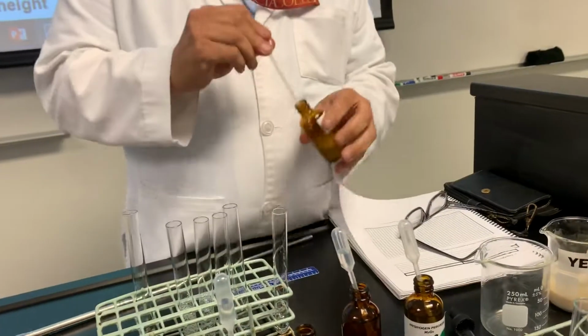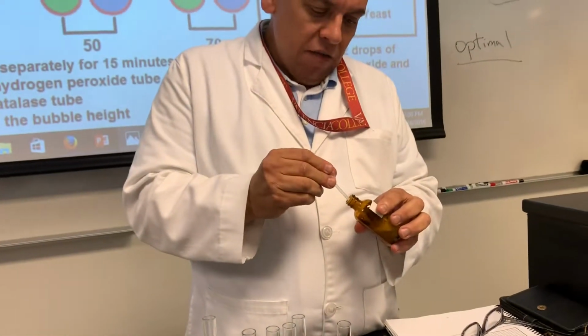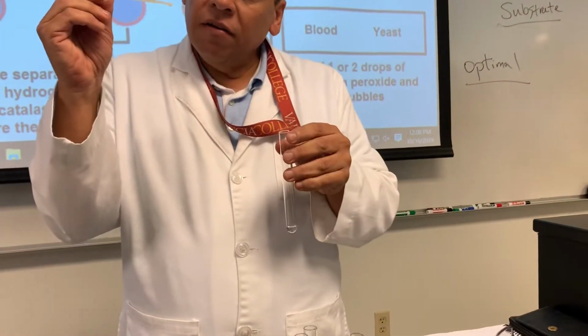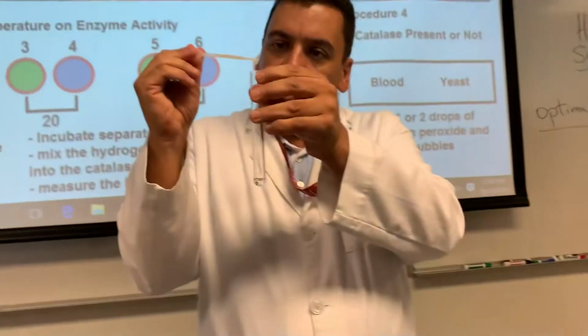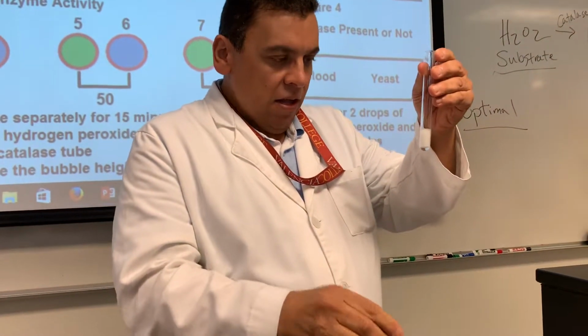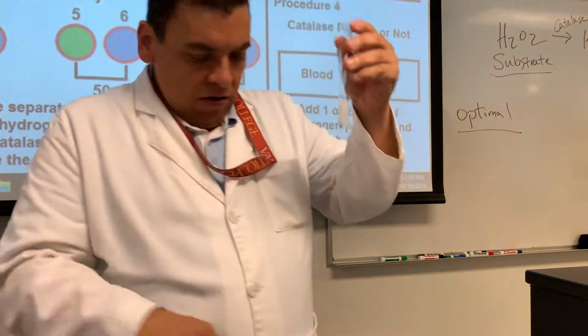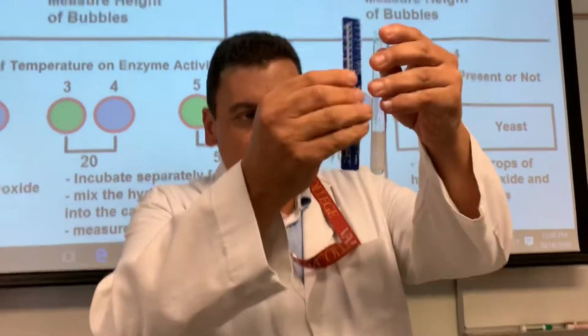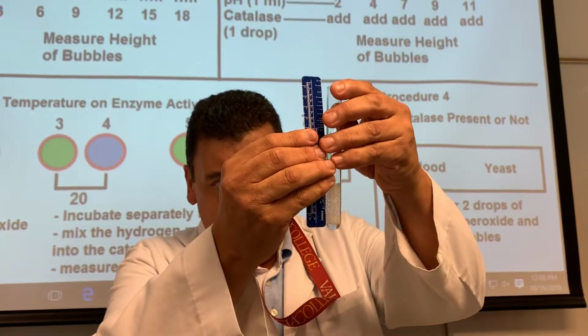Oh no. Now pH 11 is weird. pH 11 is supposed to be lower, but sometimes it acts really weird. Why is that? I'll tell you. It is lower. Thank God. Sometimes the bubble is bigger. 41.